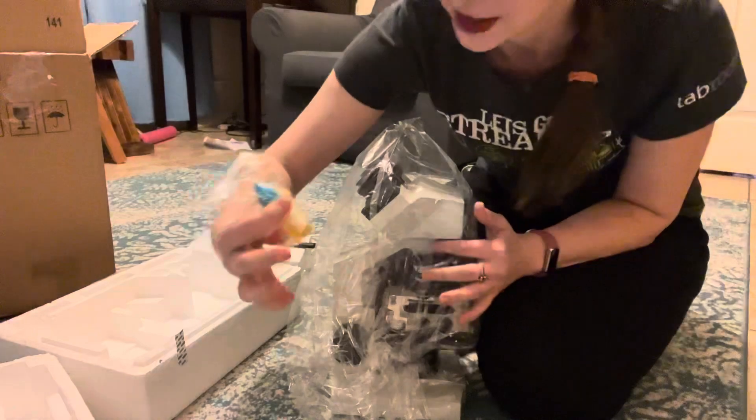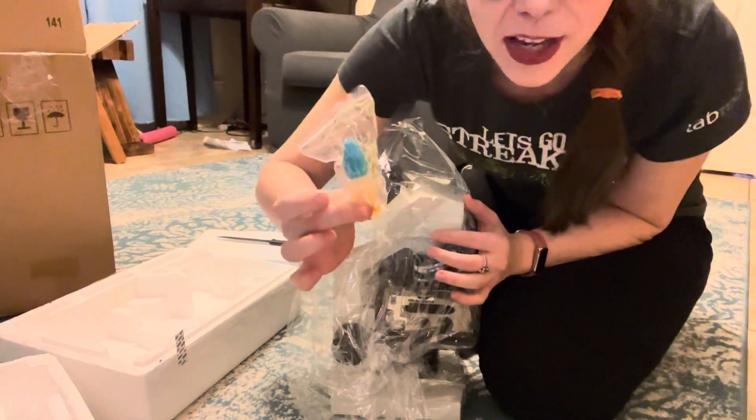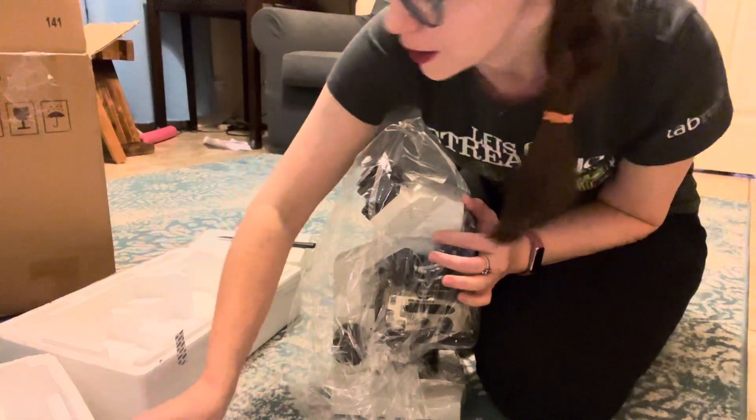There's some oil for the oil immersion. Unfortunately, it looks like it got broken in shipping and so we've got oil all over the place.